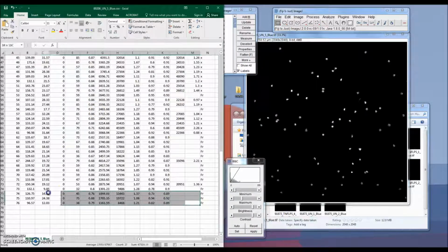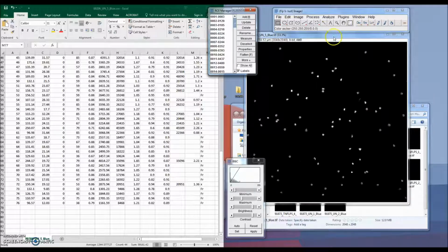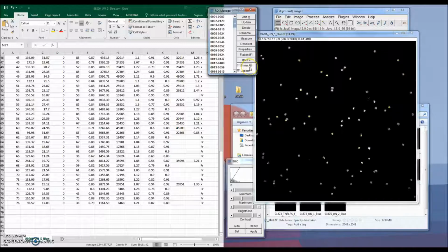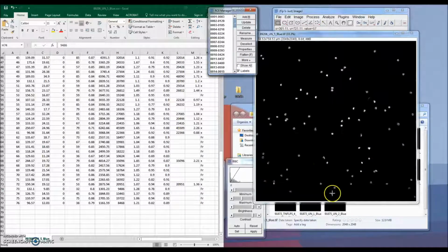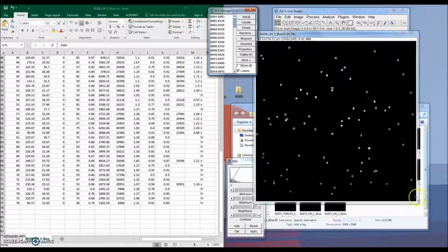Okay. So 20 I would agree with is a fragment. I also have a lot down here towards this end. 73 through 76 have all been labeled as fragments. 73, I would say that's probably not a fragment, and the raw integrated density on 73 is around 9,500. 74 doesn't appear to be a fragment, and 75 is definitely not a fragment either. Then 76 is down in the corner.